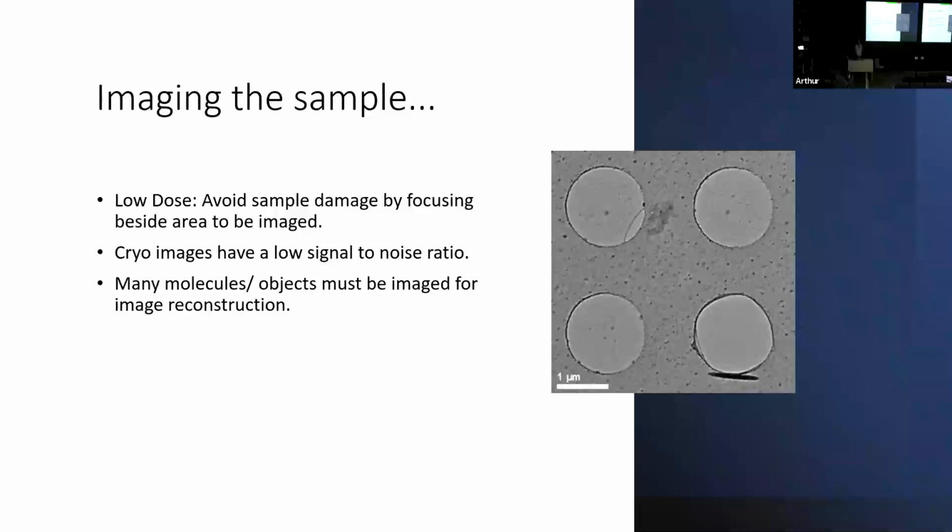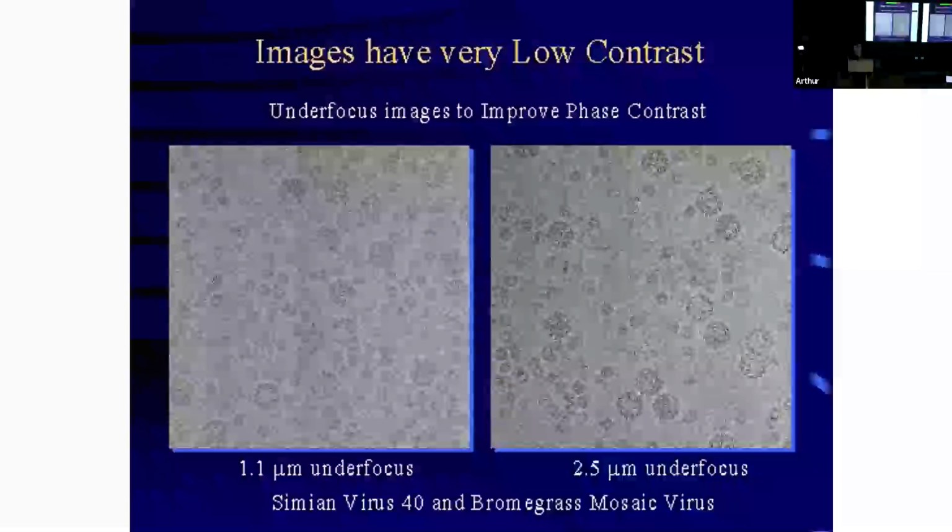Yeah. What I've just found out is that Quantifoil, who is the primary supplier, has had this big lag time. It's like 6 to 9 months or longer. But they are supposedly opening their new factory in September, which is going to cut that lag time way, way down. So that's the scuttlebutt. But also many of these other companies are making their own grids. So you don't have to necessarily go to Quantifoil. They all have their own grids that they have in stock. So you might want to consider buying something else. Yeah, it's a problem.